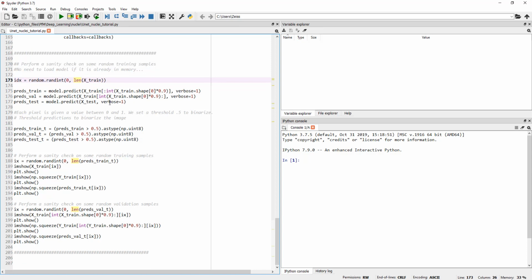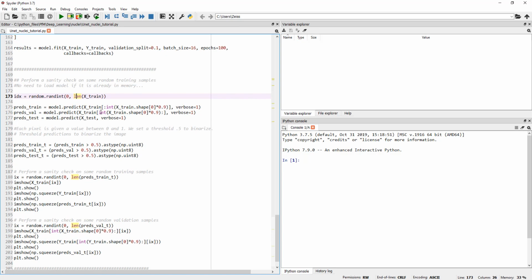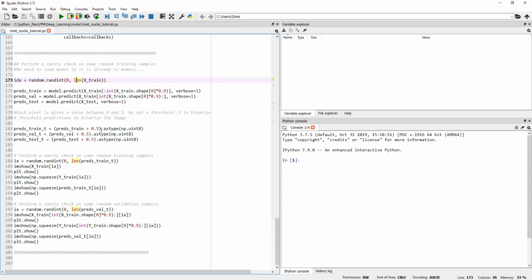And at every pixel, the result from this deep learning from UNet is going to be almost like a probability value, right? So the value would be anywhere between 0 to 1. So I want to convert that into a thresholded value. So I said, okay, any value above 0.5 at a given pixel, assign that as preds_train_t. I'm just doing some thresholding right here by setting a hard limit of 0.5. Anything above 0.5, I'm confident that pixel is a cell. If it's below that, then it is not a cell, it's the background. That's exactly what we are trying to do here, and then visualizing down here.